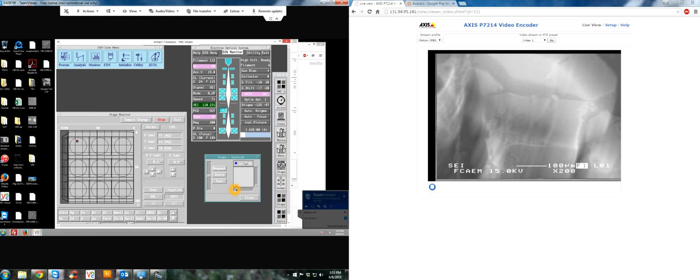I just opened it, quickly connected to the probe computer, and found the file. It's usually, if you go back, hit under the Beasley folder, it's under TIFFs. These are where the files will be saved. These are other pictures other users have taken. And then you can just open up a web browser and email it to yourself. Meanwhile, on the probe, you can close the online particle analysis. Continue navigating until you find another area you'd like to take an image of. Let's say it's that, and then do the same thing over again.